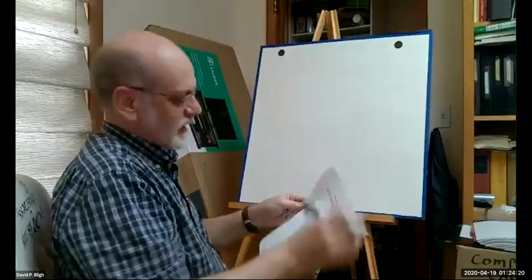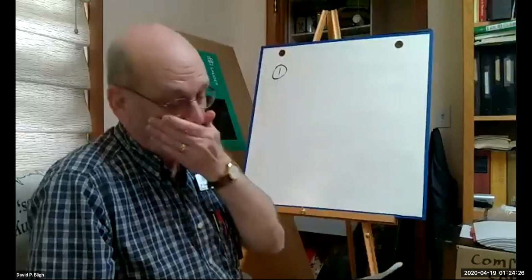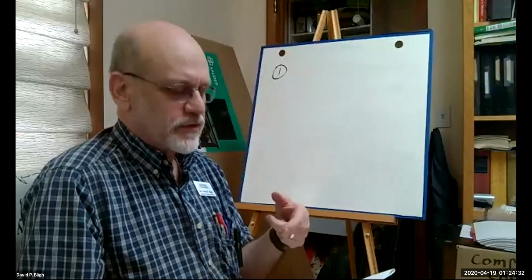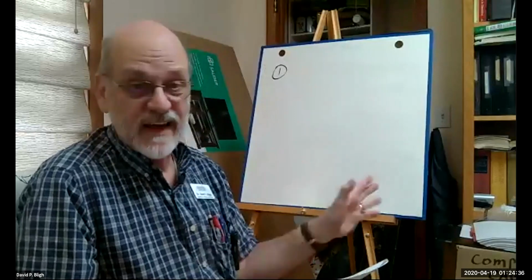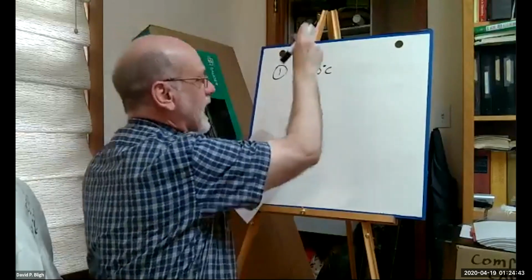All right. So, lab question 1 is what? Well, if you've got a copy of your method in front of you, I wouldn't have to read this, but I'm going to do it anyway. Suppose your thermometer reads 1 degree centigrade high every time. Your thermometer is off by 1 degree centigrade high.